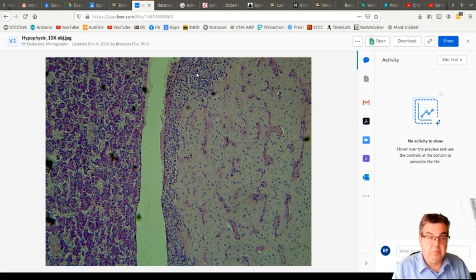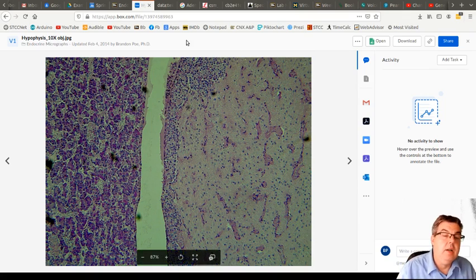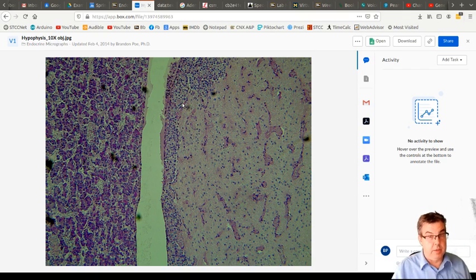So what's secreted from there apparently wasn't even noticeable in normal levels unless you had some sort of disease state. So we don't really pay attention to that part, and so we're just lumping it in here with the lighter staining posterior pituitary. But technically it's its own little thing. And I just want to be completely upfront about that so you don't think I'm waving my hands too much.